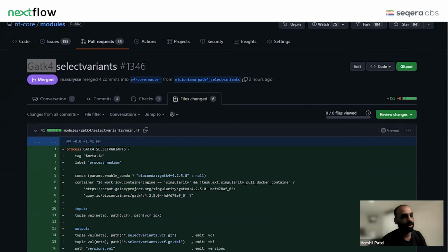And that's literally it. So you can install the module, and then all you have to do is include it in the context of how you want to run it. All of this is tracked. So if I do git status, you can see that we've added a new module at this standard path, and there's a hash in this modules.json that's been updated, and that's essentially our way of tracking the versions that we're installing within the repository for reproducibility.